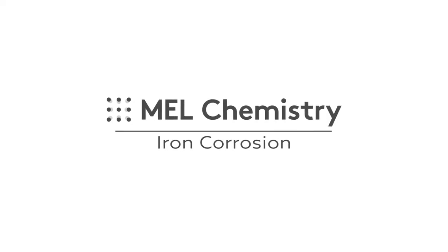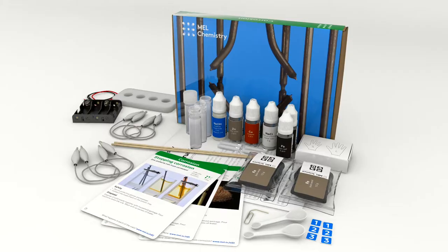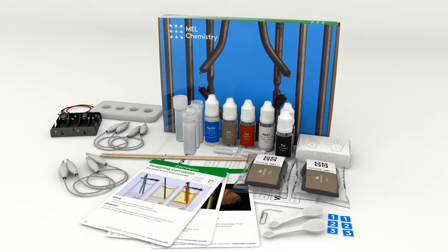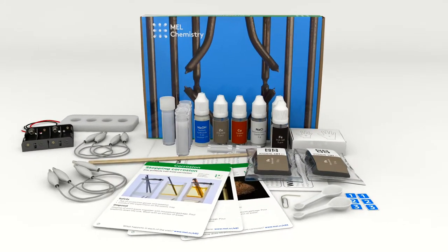Welcome to the wonderful world of chemistry. Today, with the help of the corrosion set by MEL Chemistry, we will see how iron corrodes under various conditions.